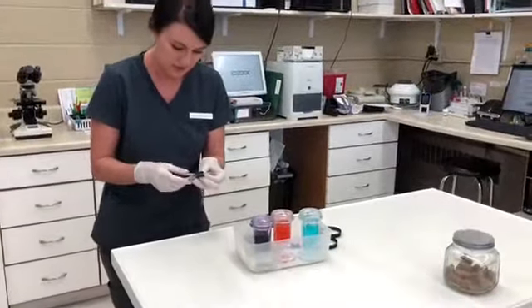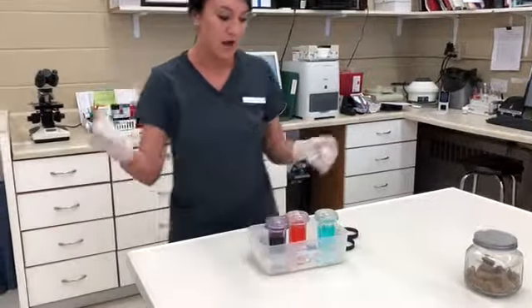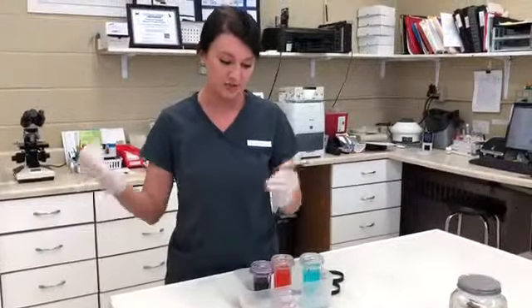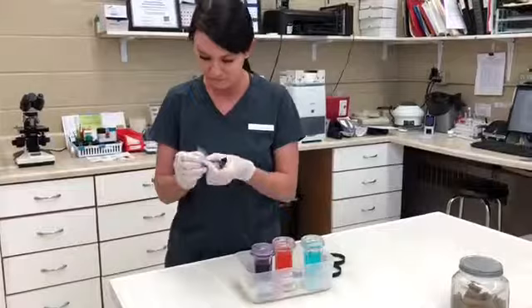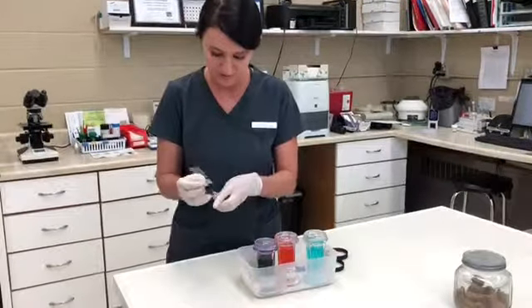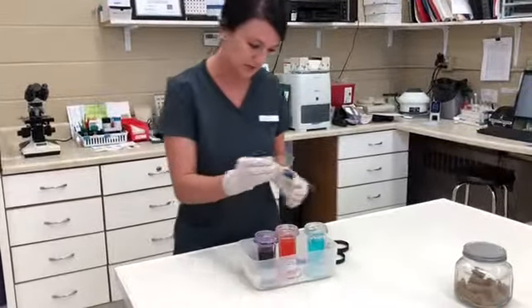I'm going to stain this just like anything else you need to stain. I'll make sure this is nice and dry. It's going to be ten one-second dips in each stain. We'll start with the fixative, then stain one and two. That looks good, we'll go ahead and start the staining process.